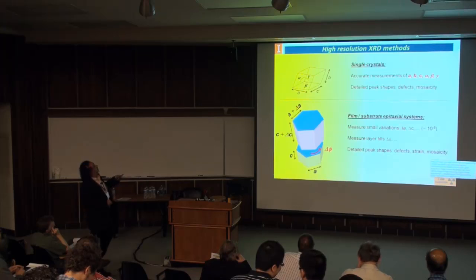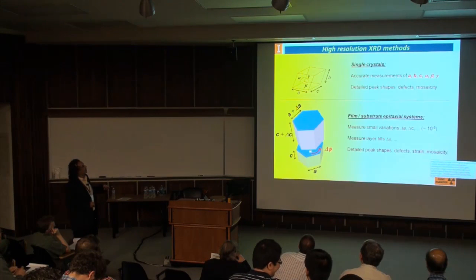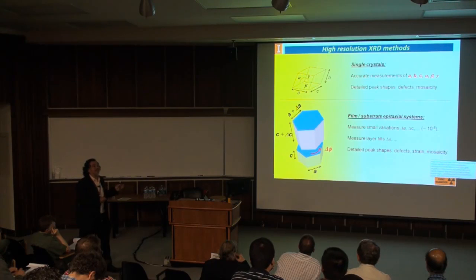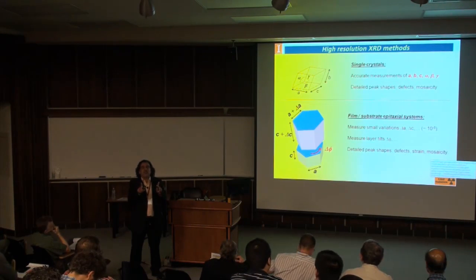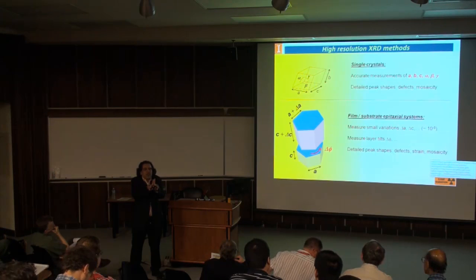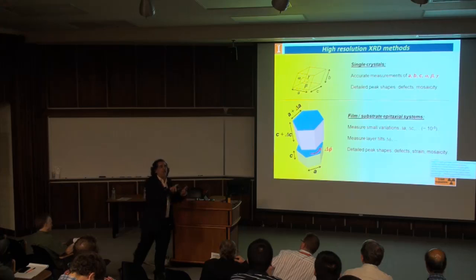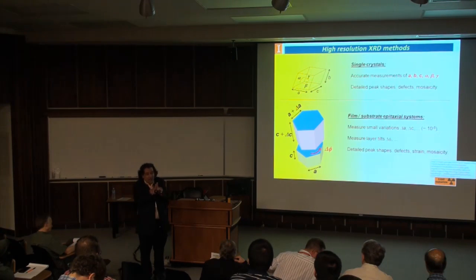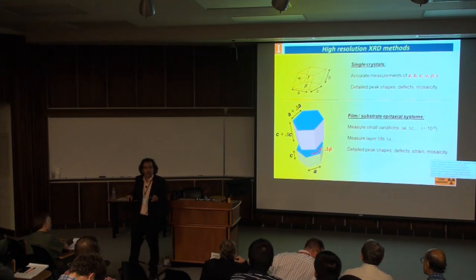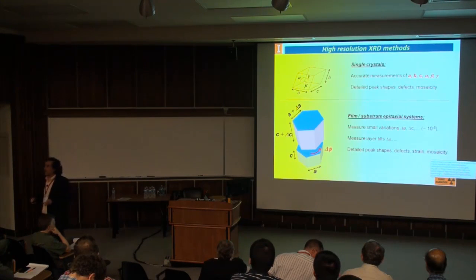No, actually to look at single crystals or in the case of epitaxial high quality films on a substrate. Basically, the situation is this. The positions of the peaks are so close to each other, like twins, that in an old instrument you can't separate them. You need high resolution. High resolution is defined as the capability of separating very close-by peaks.